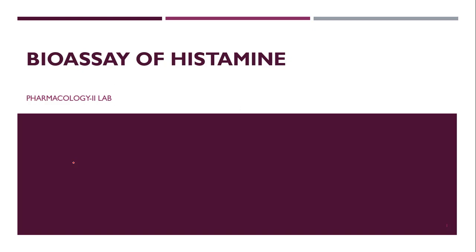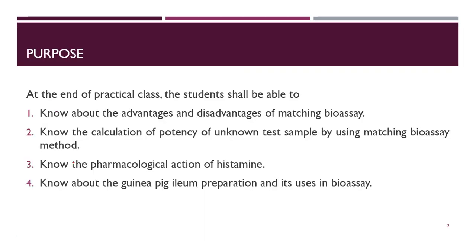Good morning, everyone. So, the next practical that we are going to start with is bioassay of histamine. It is a continuation of the things that we have studied in our theory classes. Today we will be finishing the bioassay of histamine, and the next practical will be the bioassay of serotonin.